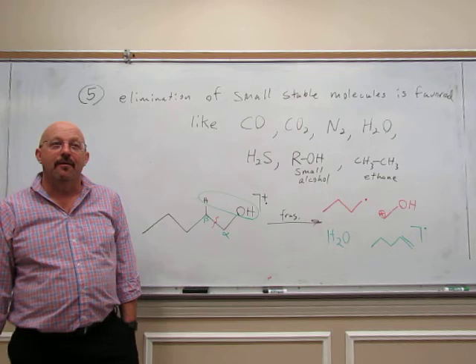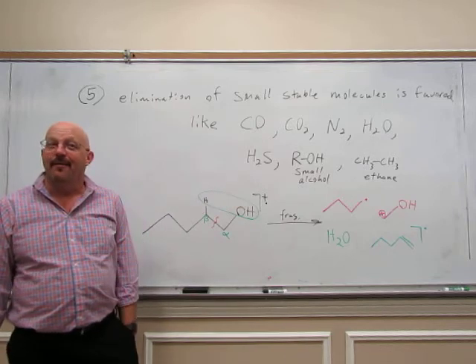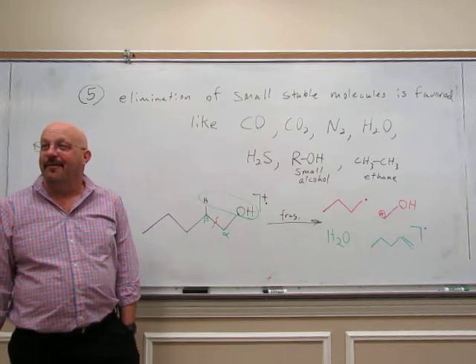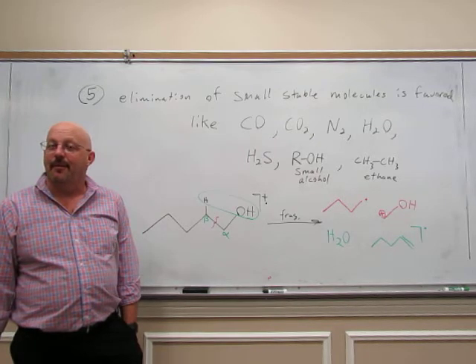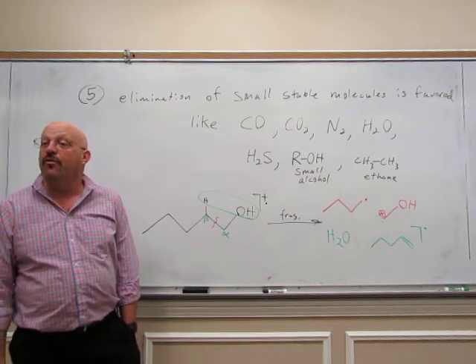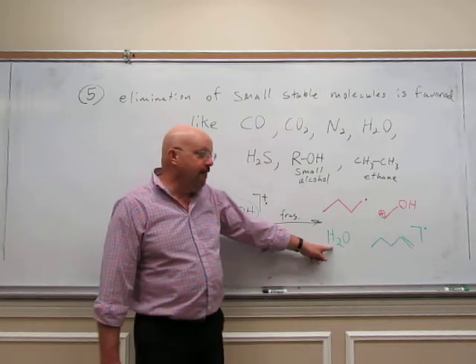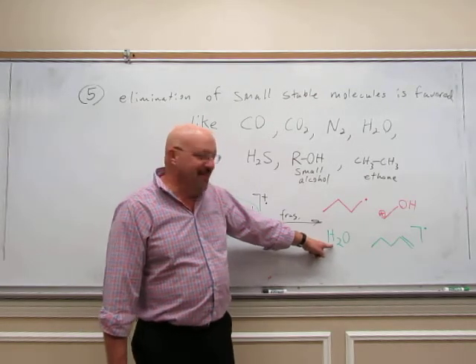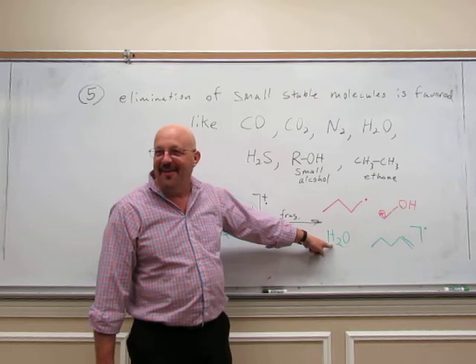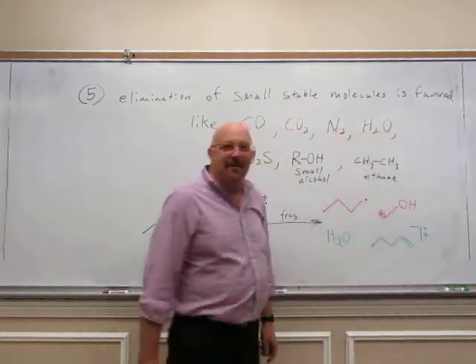Okay. So where's our cation? We had started with the radical cation. We've still got a cation somewhere. Is that going to fragment again? This one? It might. That's a possibility. But where's the cation to start with? Is the cation on water? No, water's neutral. If it's not, we're all going to die really quick. So the cation's here. That's a radical cation.